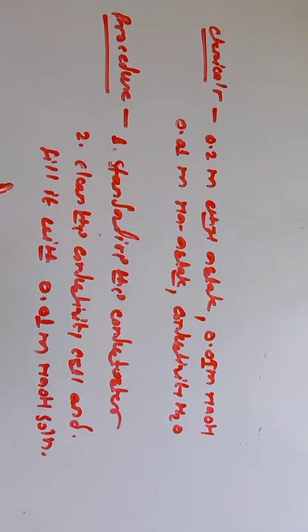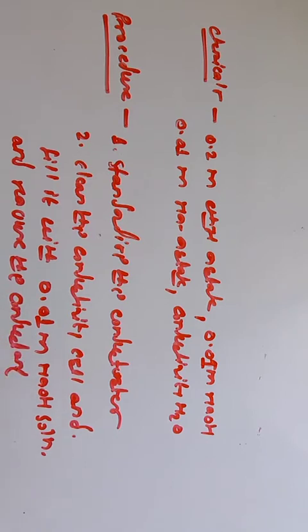Measure the conductance of this NaOH solution and call it C0. So the conductance of this 0.01 molar NaOH solution is considered as C0.